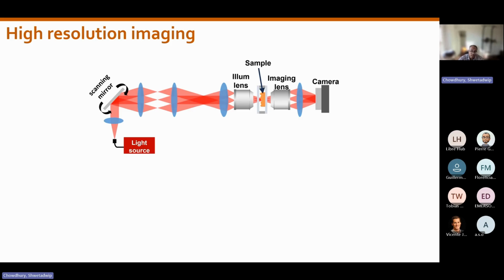Currently our system is using a scanning mirror that tilts the angle of the beam onto the sample. This is what I showed before. The problem with this method is that to properly reconstruct this 3D sample, we need hundreds of measurements. And the more complex the sample is, the more measurements we need to take to solve that inverse problem, right?